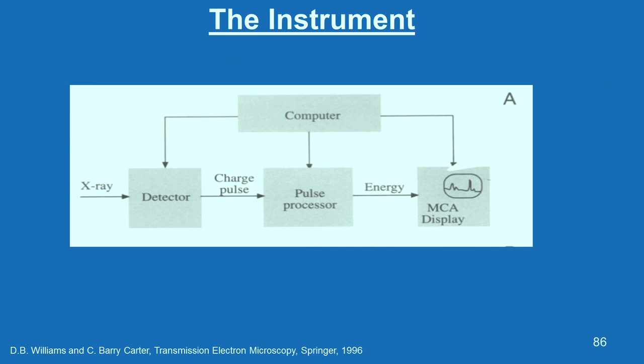And the instrument details are like this. You have X-rays coming in, and you have the detector, which has a charge pulse and pulse processor, and then you have energy, and then you have the MCA display. Everything is controlled by the computer.